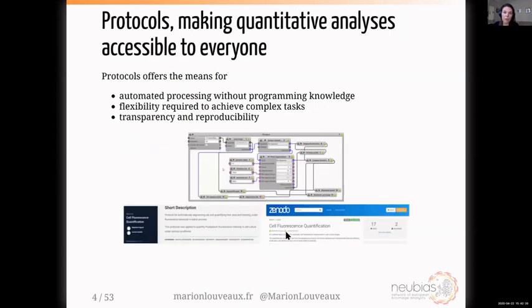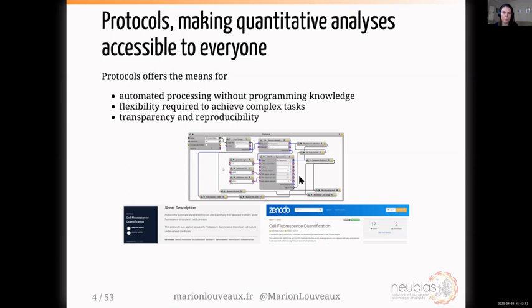In the second part, I'll explain a feature of ICY called protocols — the series of blocks linked together that you see in the middle of the screen. I'll show how it allows automated processing of images even without programming knowledge, and explain that it has flexibility for more complex tasks. I will also emphasize the importance of transparency and reproducibility that this feature enables.